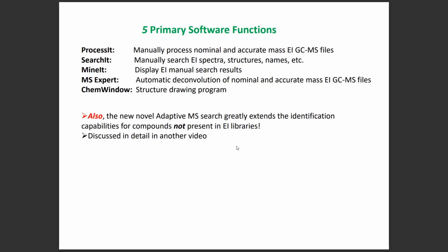Also, the new software contains the very novel Adaptive MS Search, which greatly extends identification capabilities for compounds not present in the EI libraries. This capability will be discussed in detail in another video. But now, let's go to the KnowItAll software.